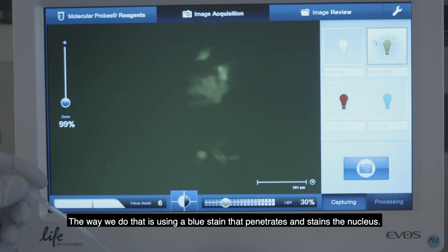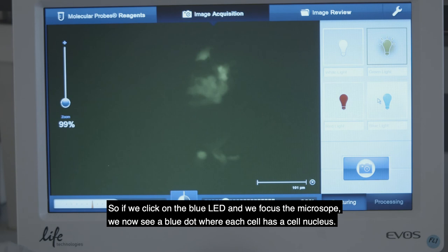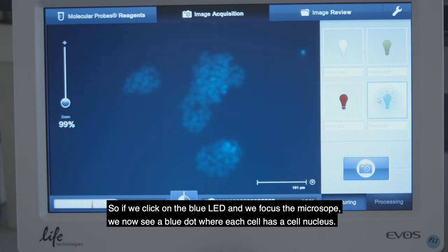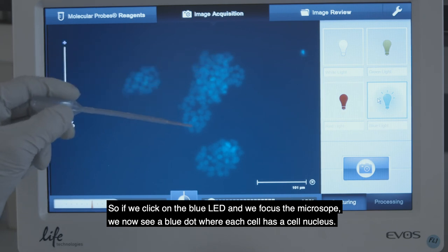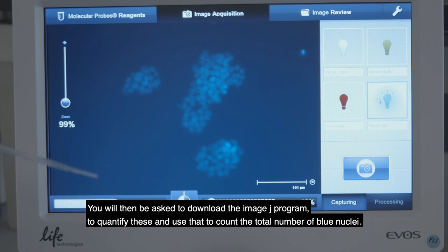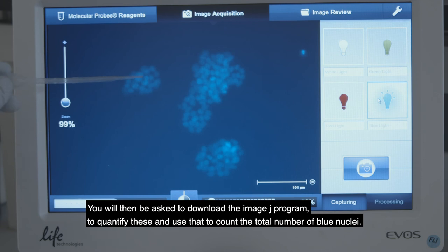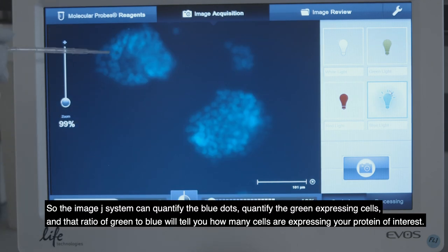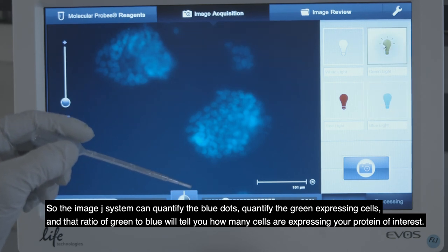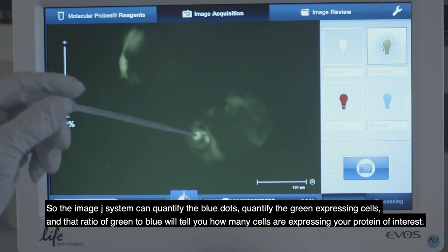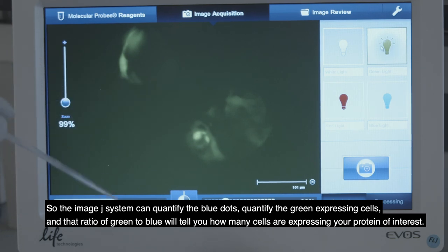Of note, some cells express strongly and some express weakly, which likely reflects the amount of DNA those cells took up. Using a blue stain that penetrates and stains the nucleus, we click on the blue LED and refocus the microscope to see a blue dot where each cell has its nucleus. You will then use the ImageJ program to quantify the total number of blue nuclei and the green expressing cells. The ratio of green to blue will tell you how many cells are expressing your protein of interest.